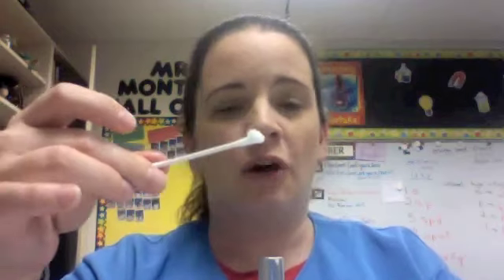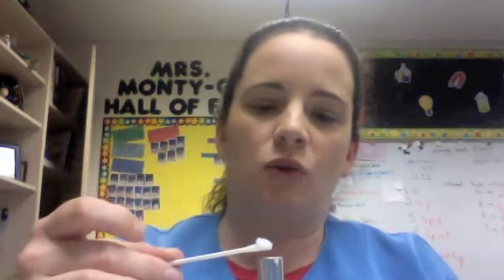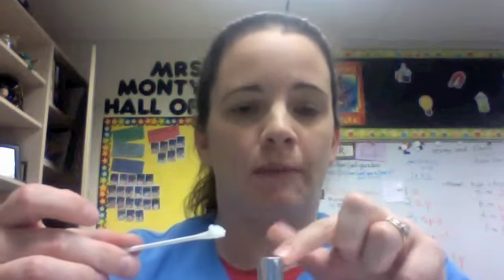Now, here's the only thing you have to be very careful with in this lab. Don't put it right at the base of the flame. We don't want the crystals of the solid to fall into the flame or get stuck on the edge of the Bunsen burner. If that happens, then every time you light the Bunsen burner, it's going to have that color, and you won't be able to tell the difference in colors between the different elements. If that happens, turn off your Bunsen burner, get a piece of paper towel, wet it down, and try to clean it out as best as possible. Get it off of there.